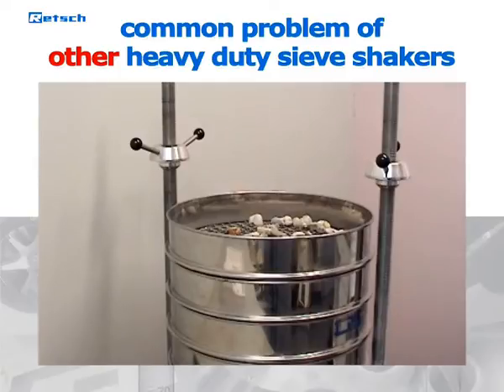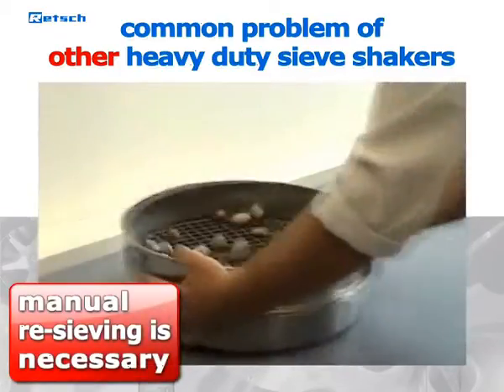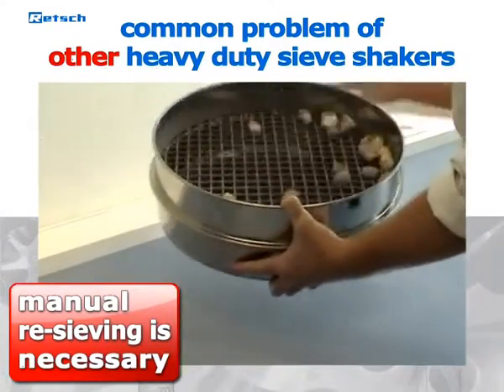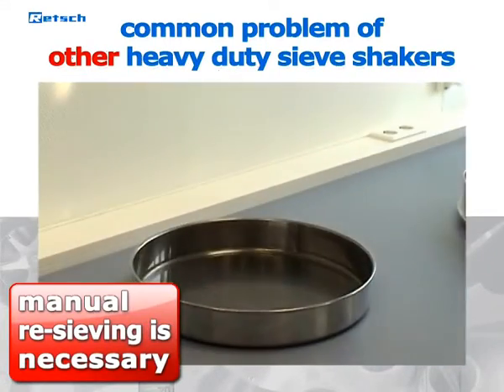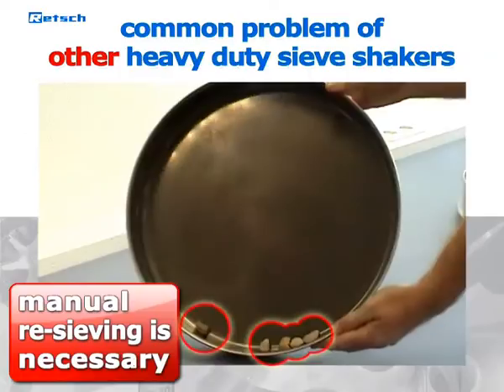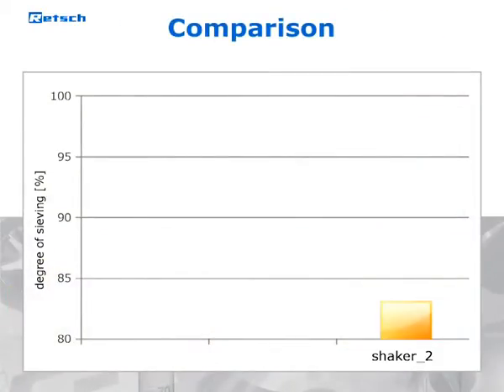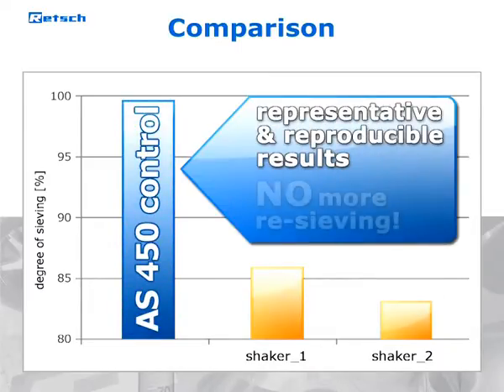Worldwide users of heavy-duty sieve shakers are familiar with the problem that the material is not completely separated after sieving. In order to complete the process and to optimize the degree of separation, bothersome manual re-sieving of the remaining material is necessary. The AS450 Control is the first and only sieve shaker for heavy loads which provides representative and reproducible results with the highest degree of sieving, and therefore eliminates the need for re-sieving.